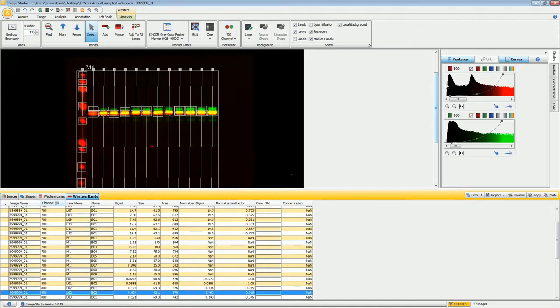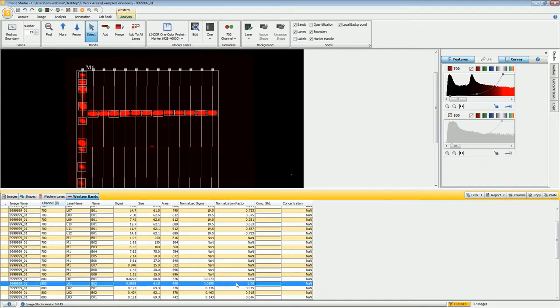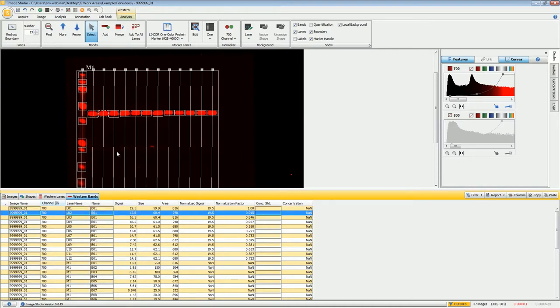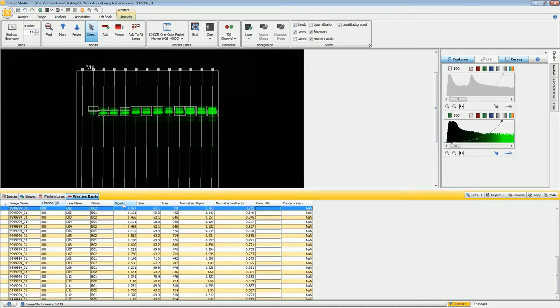The Normalized Signal is based on what was defined as the normalizing channel. In the normalizing channel, it finds the band with the highest signal — in this image that is the leftmost band with a signal of 19.5. It divides that signal by itself to come up with a normalization factor, then for all other bands in the normalizing channel it divides their signal by the highest signal. So it has determined there is 91.5% as much protein loaded in the second lane compared to the first. Going to the 800 channel, it takes the signal from the band in the second lane divided by that normalization factor to produce the normalized signal. More explanation is available under the Help section.